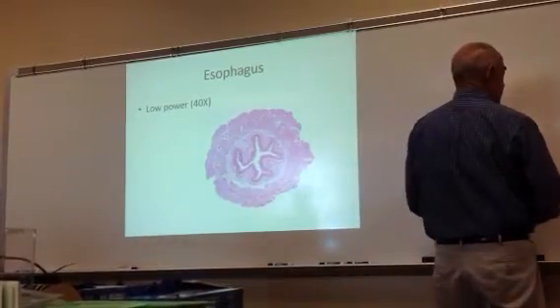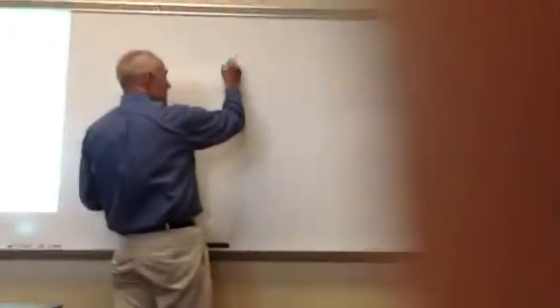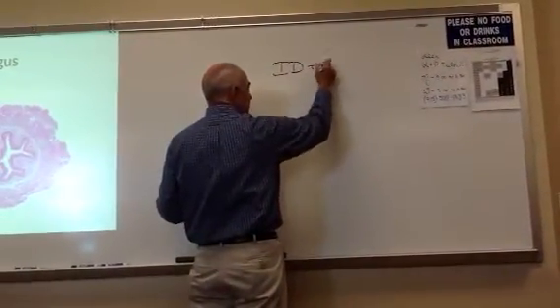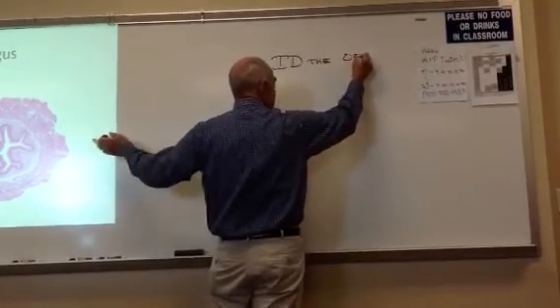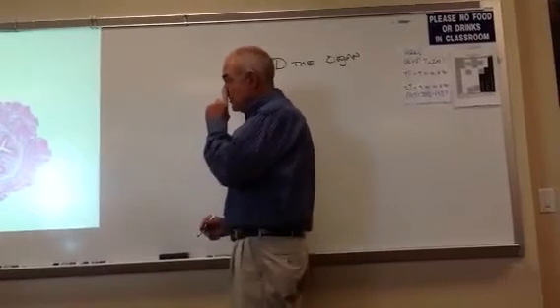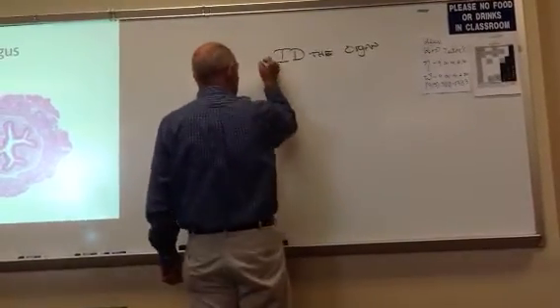Here's what we want to be able to do when we have our practicum next week. We want to be able to identify the organ. So if I have this slide up there on the screen or on the microscope, you're going to look at that and you say, oh, that's the esophagus. Okay? So identify the organ.